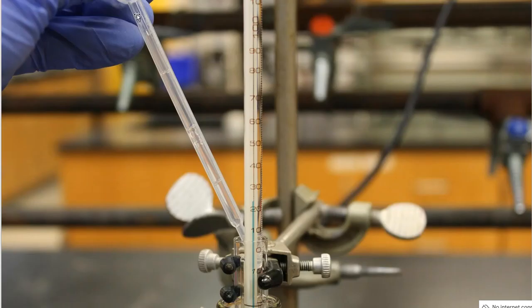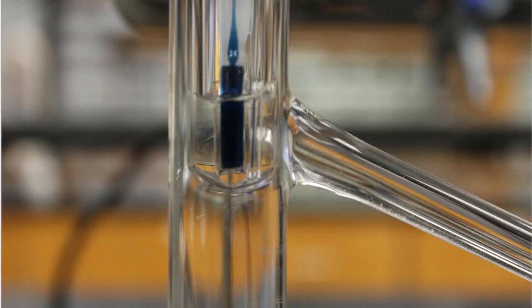All right, so here's a close-up picture of me dispensing some of that unknown liquid into the test tube that has my upside-down capillary tube. You can see my upside-down capillary tube right there, and my thermometer as well. All right, well, how much liquid do I need to put in? Notice the position here, folks. My test tube stops right here, and the test tube is at this elbow joint. Okay, so that's where I want the bottom of my test tube to be located. Okay, that's the perfect position for that.